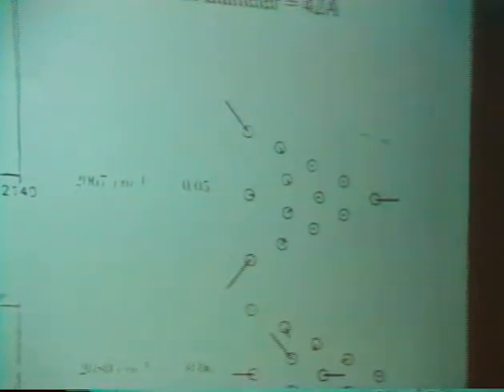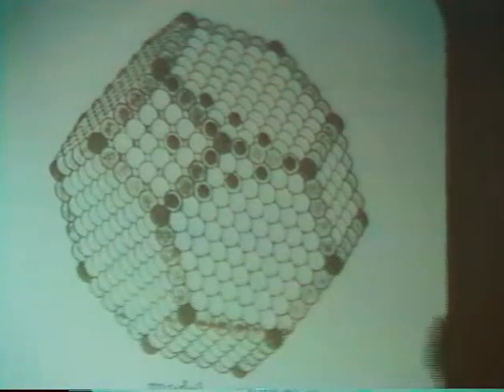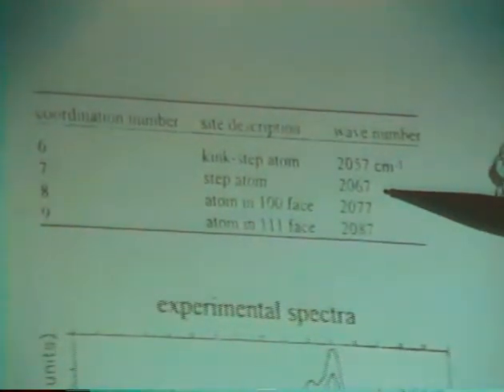The one that's the lowest frequency, nothing much is participating except these 3 isolated molecules, which you see are molecules adsorbed on edge sites, whose frequency on the extended single crystals is 2067. They're far enough away in this normal mode that they don't couple, and the frequency of that normal mode is 2067.